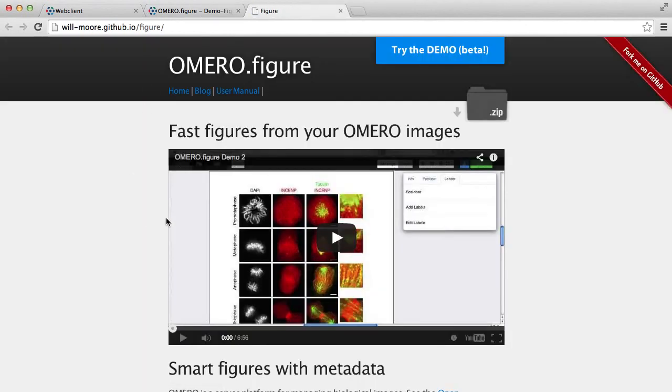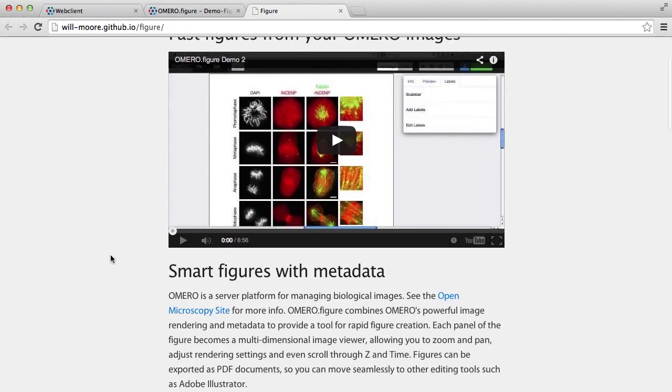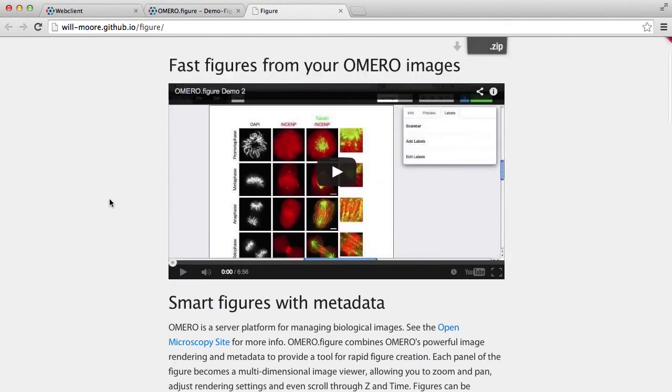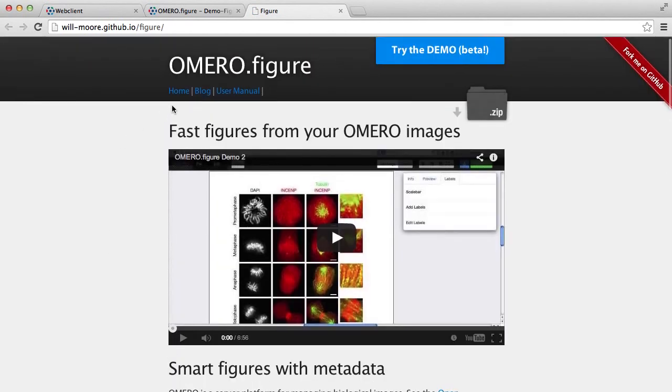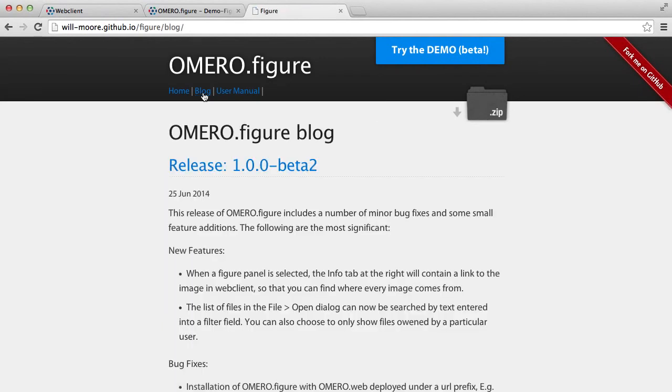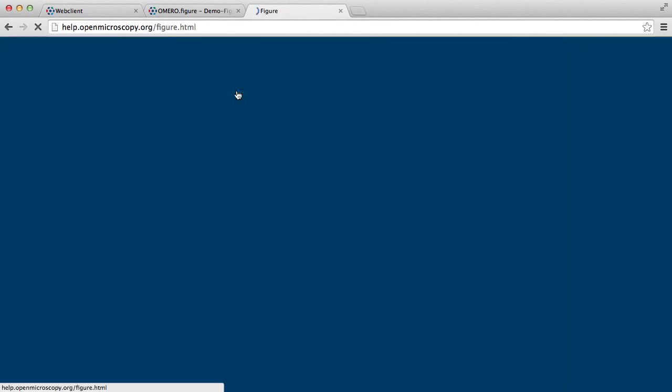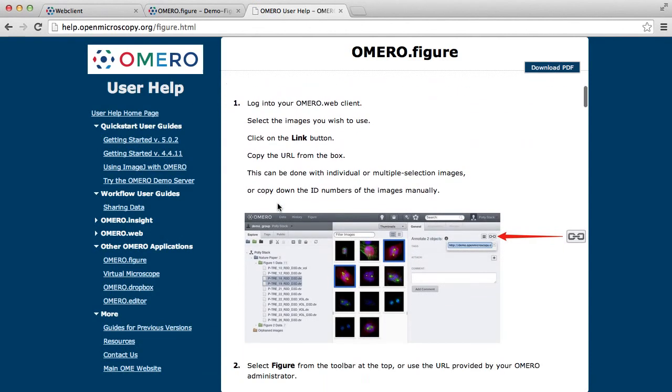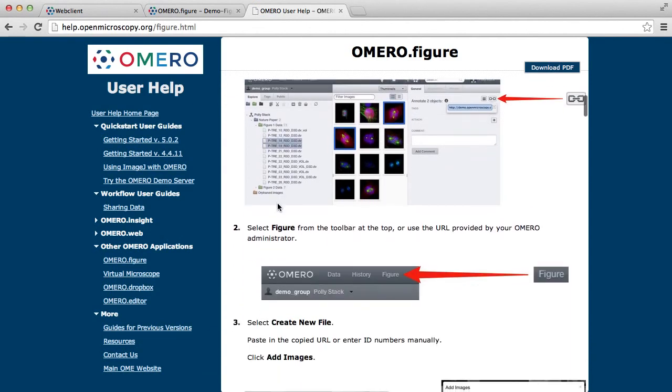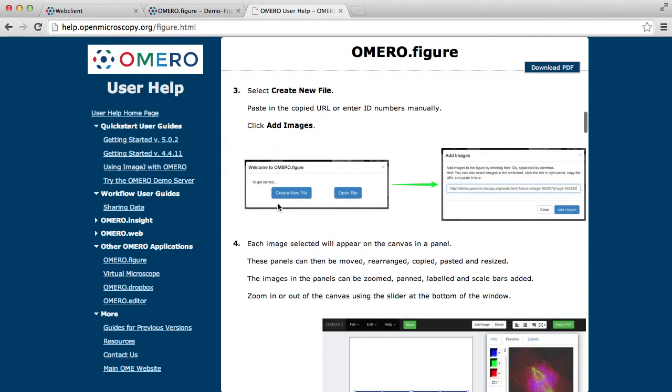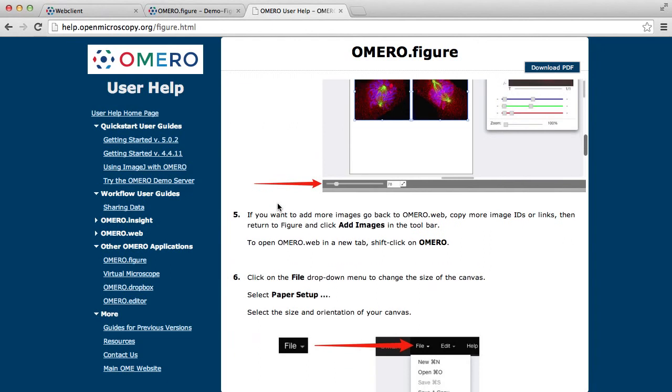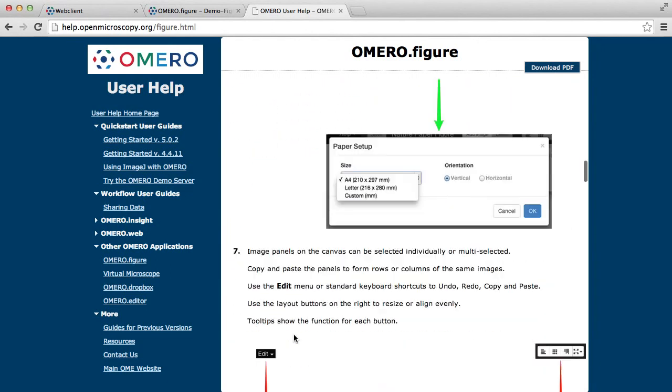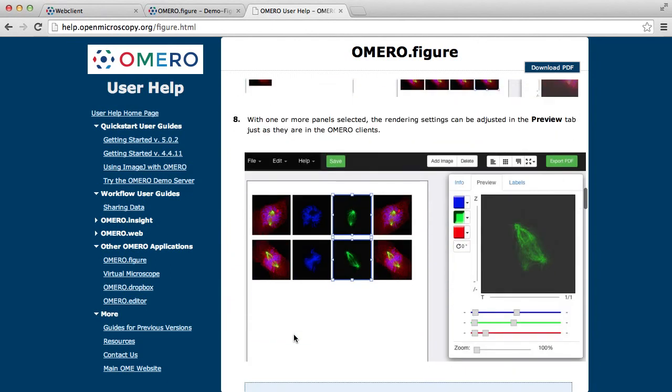there's an introduction and installation instructions, as well as a blog with a few posts, and a user manual which gives a good introduction and explanation of the features of OMERO Figure.